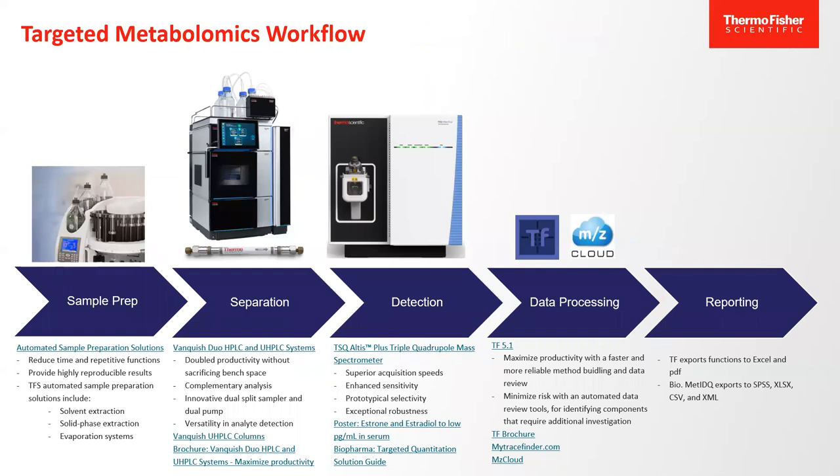Okay, now, targeted metabolomics. Targeted metabolomics could use a triple quad or it could use an Orbi. Okay, a lot of people say, you know, Craig, I really want to do targeted. Unfortunately, all I own is an Orbi. Guess what? An Orbi is a triple quad on steroids when it comes to targeted metabolomics. The Orbi will actually do better than the triple quad because your selectivity is way higher. So the triple quad could do targeted, or the Orbi can do untargeted and targeted, your choice.